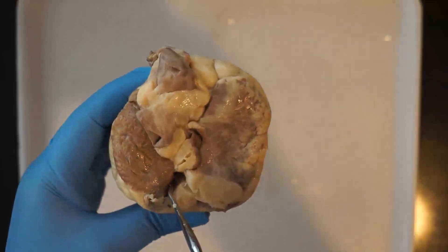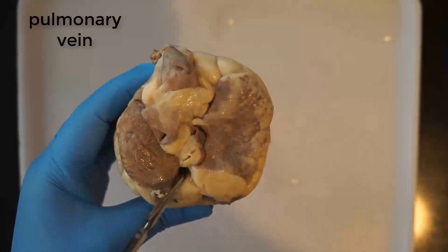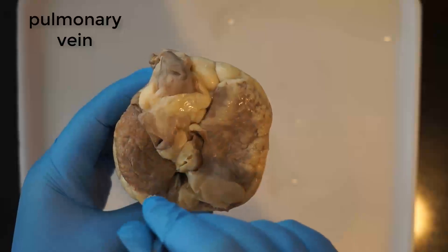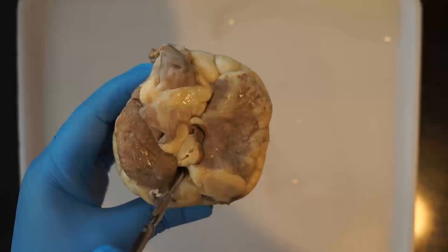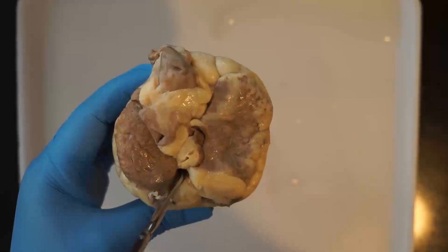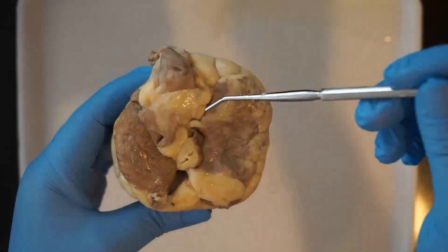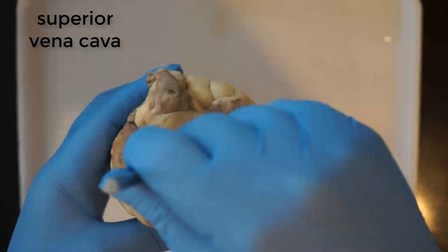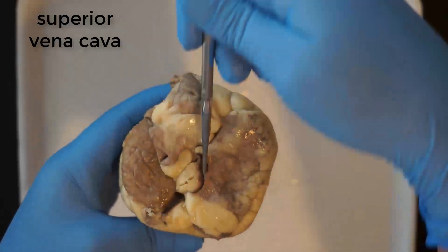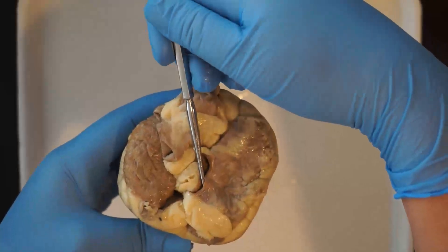See if you can find the pulmonary vein near the back of the heart. That delivers blood from the lungs into the left atrium of the heart. You might be able to feel that left atrium if you push in there a little bit with your probe. You'll also be able to see the superior vena cava, which brings blood down from your head into the right atrium.